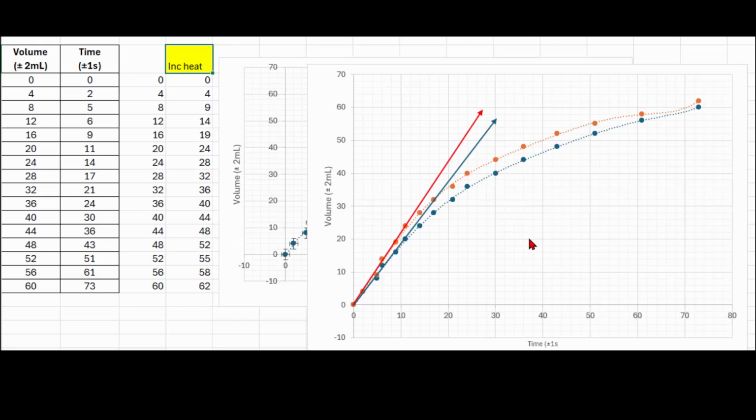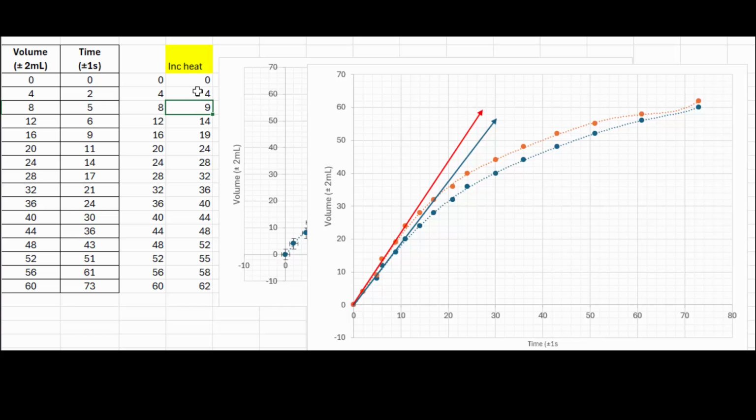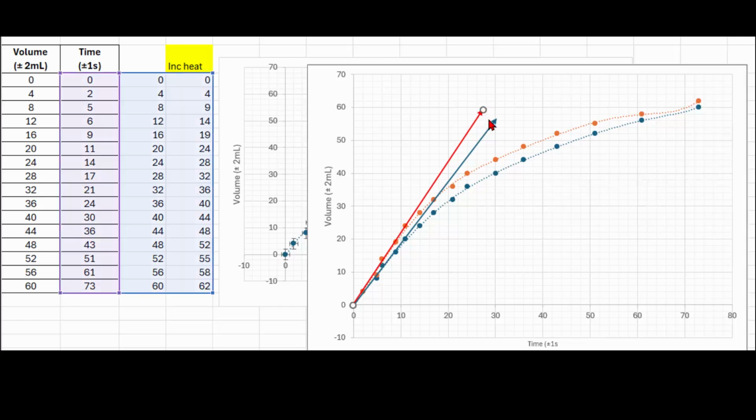But if you look at the data and you see that you're getting, perhaps with the stronger concentrations, a higher initial rate than you're intending to, I've mimicked that by just slightly increasing it more and more, because as the reaction progresses, everything's getting hotter, so the gas is getting hotter and hotter. And so that's what the graph might look like. If your initial rate is creeping upwards, it may be that it's caused by the heat.